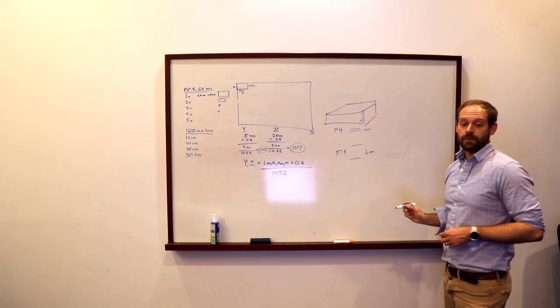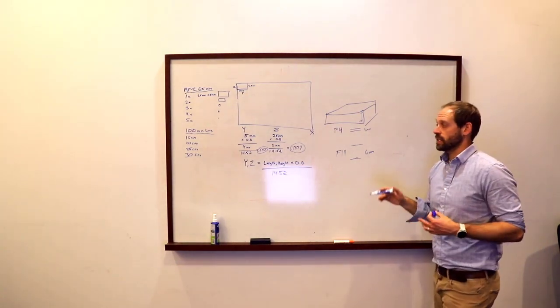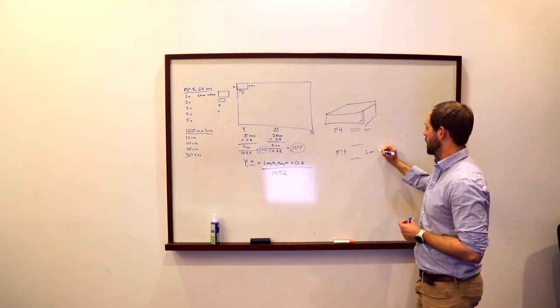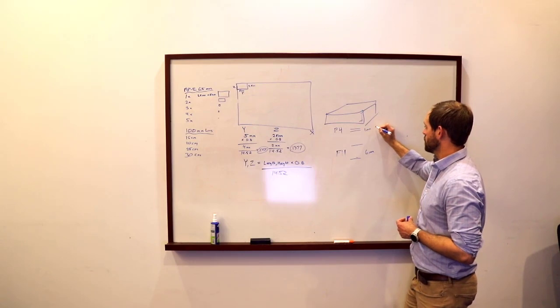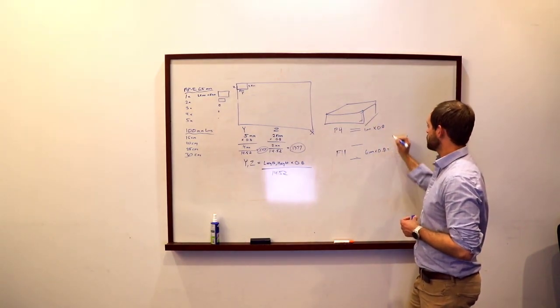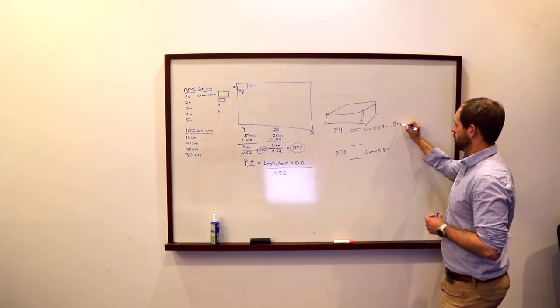And what's really nice for the stacking portion of this is that this is actually tied to the exact distance. So you can basically multiply 1 or 6 times 0.8. Remember, you need your 20% overlap. And you can arrive at 0.8 millimeters here.